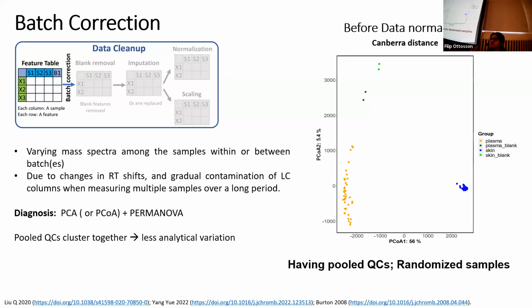We did observe some batch effect. Fortunately, it did not affect the question that we were asking, especially about the diphenhydramine drug. So we didn't touch anything. We didn't perform batch correction. I just wanted to give you an idea that if you observe batch effect, you might need to do it.